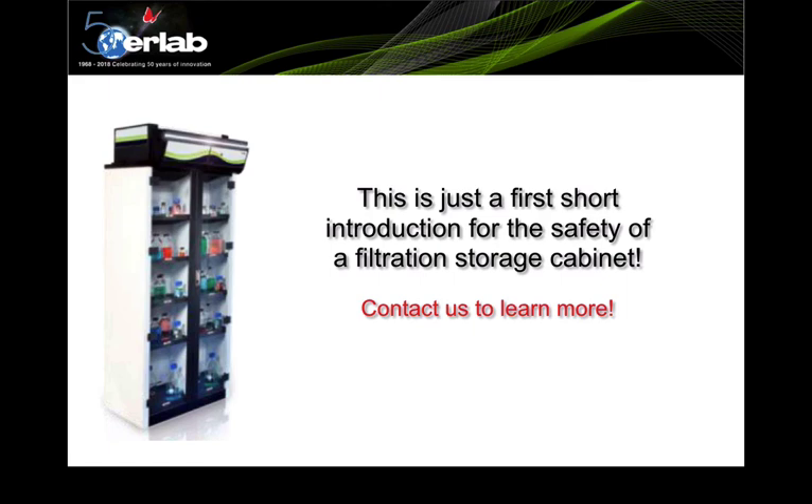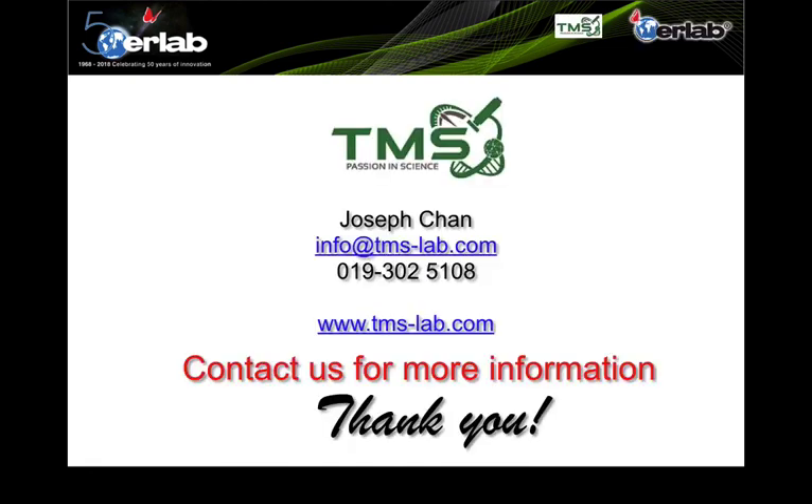This has been a short introduction to the safety of filtration storage cabinets. Contact us to learn more. Thanks for listening — please visit our website at tms-lab.com.